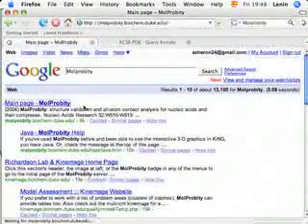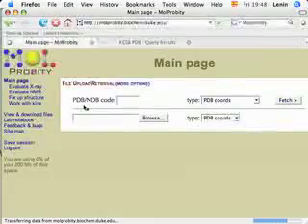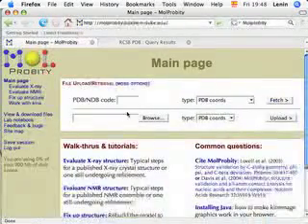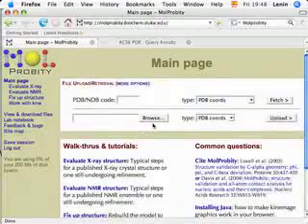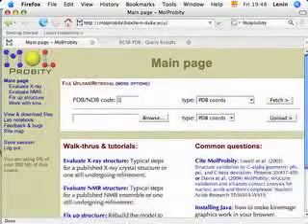You can easily reach the MolProbity webpage via Google, or you can search it by any other means. The important thing when you are on the MolProbity page is that you don't need to download any structure from the Protein Data Bank, since MolProbity can access it directly. We just need to type the PDB code of our structure of interest, and voila.